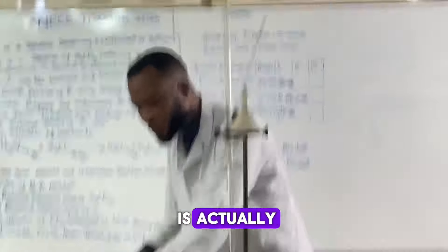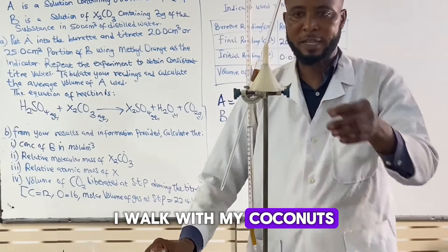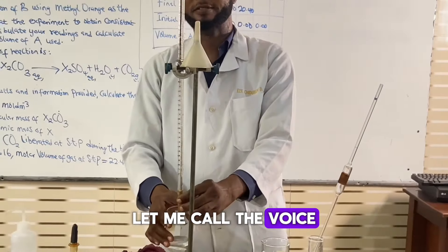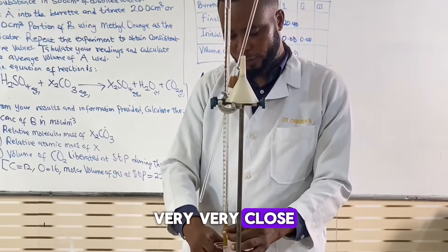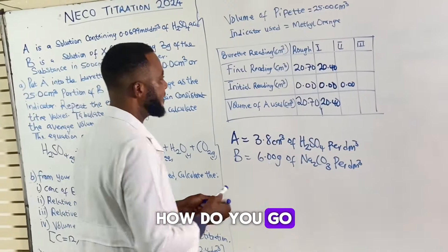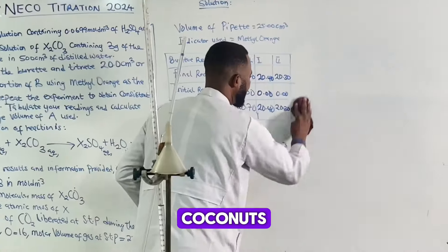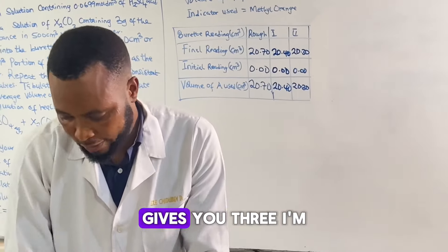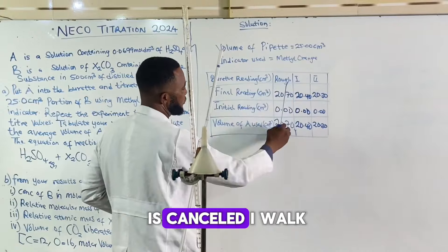If I actually get a concordant reading, I can do away with the rough and work with my concordant values. There's a macro calibration then. Let me calibrate. I will try as much as possible to get either this or very close. The reading is 20.3. I think there's no need for another run. I'm noting my concordant readings: 20.40 and 20.30. I will decide to do it when we talk about concordant values. I'm not going to penalize you if you do it up to 3 titrations. Except if the table gives you 3.